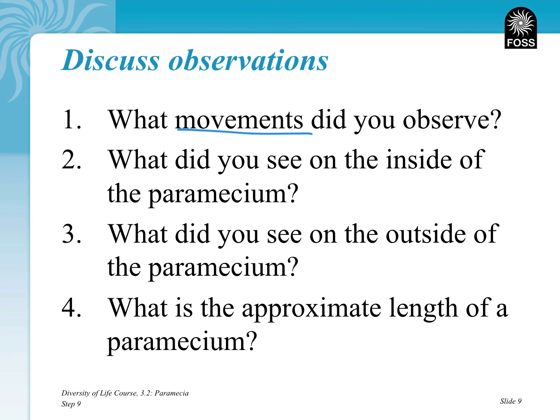Number 2. What did you see inside of the paramecium? Saw a bunch of things: blobs and bubbles and dark areas and shadings and all sorts of stuff, circles, all different kinds of structures inside there as well. What did you maybe see on the outside of the paramecium? Maybe there were some folds, some grooves, maybe skin, maybe little hairs. All those kinds of things were what I saw on the outside of it.